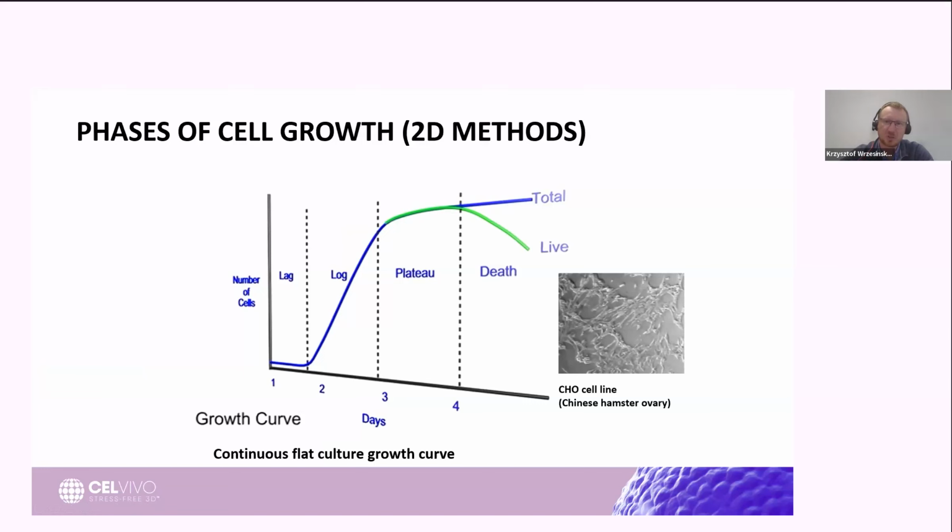Unfortunately, due to technological aspects such as controlling the cellular population or the proximity of the decline phase, most of our 2D-based experiments have been shifted to the log phase, which from the technological point of view is the easiest phase to control in our 2D in vitro systems.